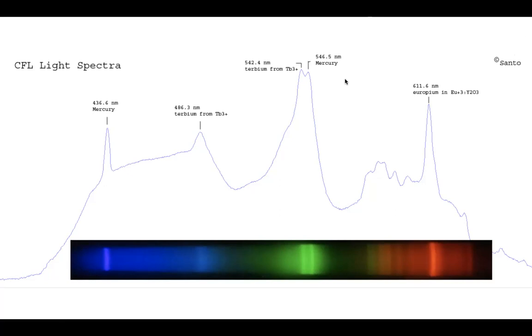Yeah, I guess what I should have added at the end of the slides is that we're going to have one spectrum from water and one spectrum from the sample. The water will show you a spectrum which has certain colors in it, or mostly, if you point it to a white tile, it should have all of the colors in it. Now, when you add the sample and take the spectrum, there will be some colors missing, which will have been absorbed by the sample. And so we can compare these two spectra. The water essentially normalizes it and finds out exactly how much color has been absorbed, which is missing in the spectrum. And that will be a proxy for the amount of chlorophyll, which is the proxy for the amount of algae.